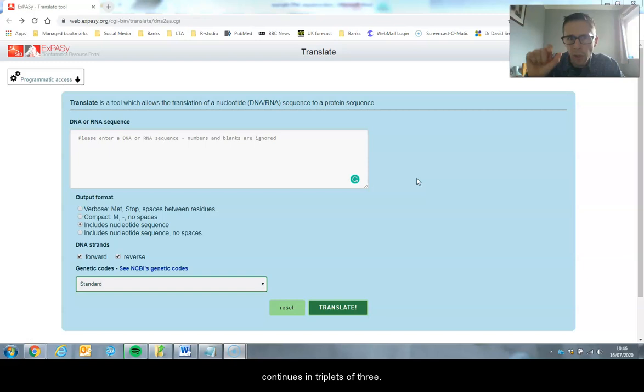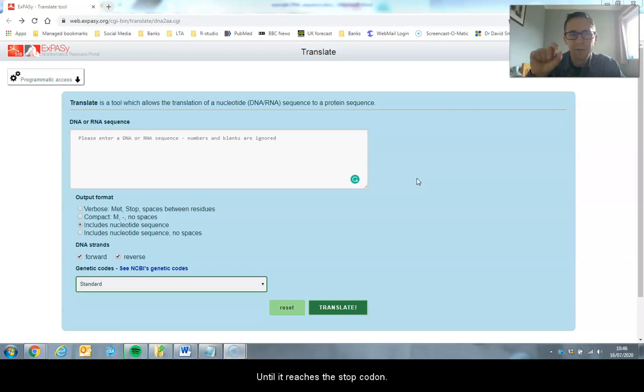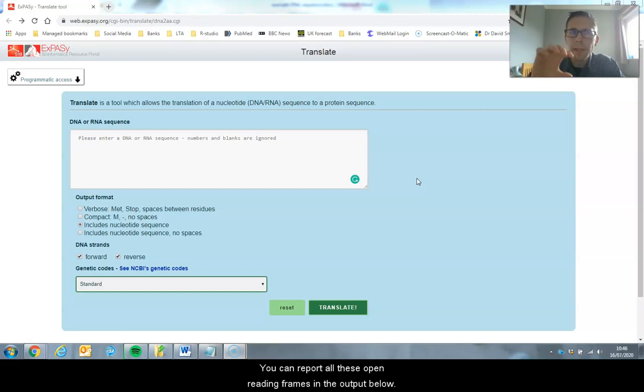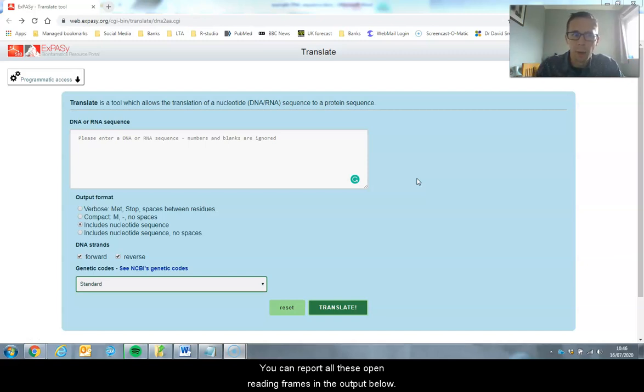It then continues in triplets of three until it reaches a stop codon. It reports all of these open reading frames in the output below.